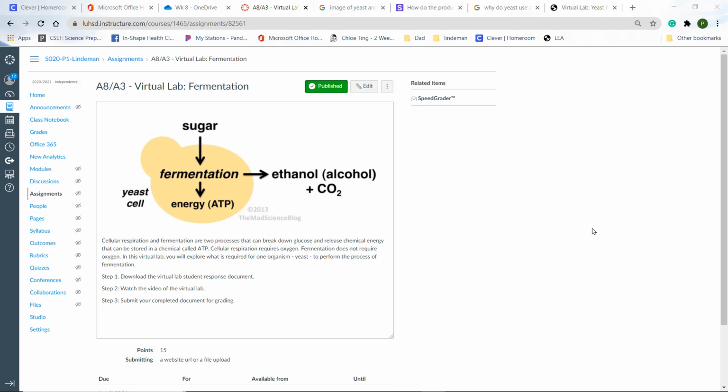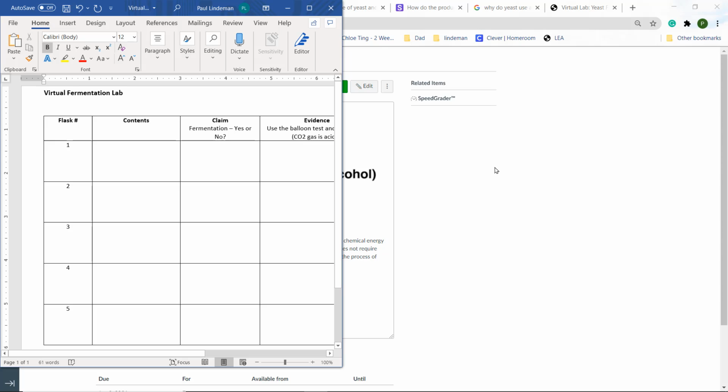Hello, in this video we are going to do the virtual lab for fermentation. The reason we're doing a video is that it is an Adobe document and sometimes it does not open on your computers, so we're just making a video of it. As we go through the video, you will fill out this virtual fermentation lab document. That is what you downloaded. So let's get started on this.